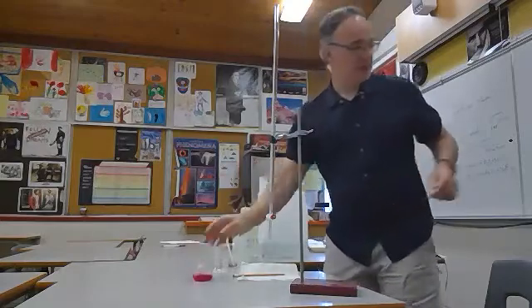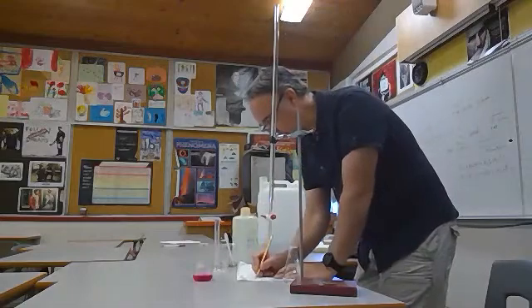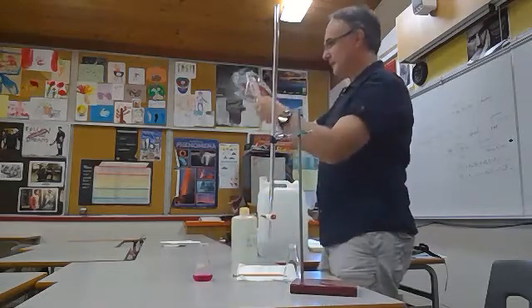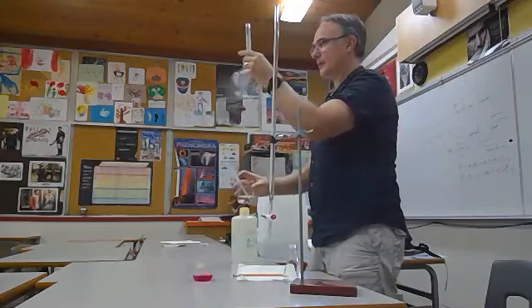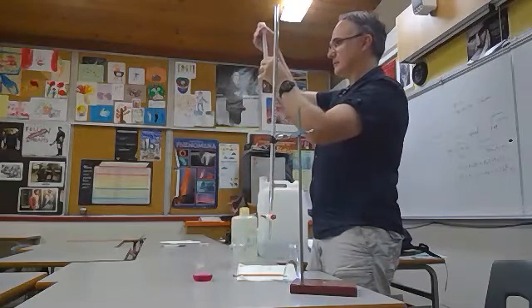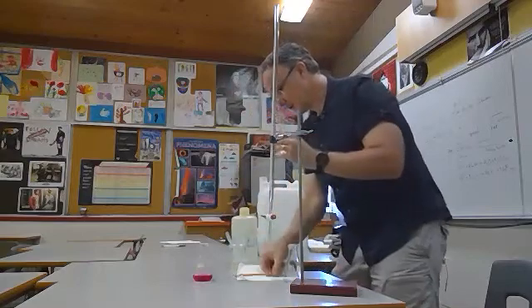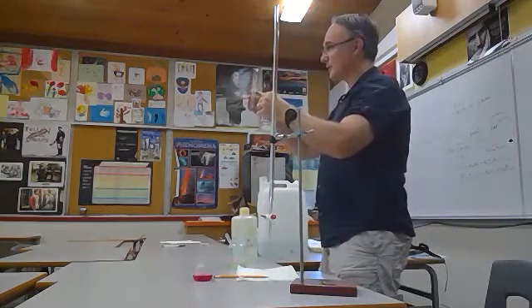What was in here, first of all, was acid. The acid I'm going to try to neutralize is hydrochloric acid, HCl. I'm going to measure 10 mils of this. That's the acid there, so I add 10 mils of this here. Just add a little bit. Right now, that's 10 milliliters, so we have 10 mils of acid. And I'm going to pour this into a flask here. Right now I don't know the concentration of this chemical, but I know it's hydrochloric acid.